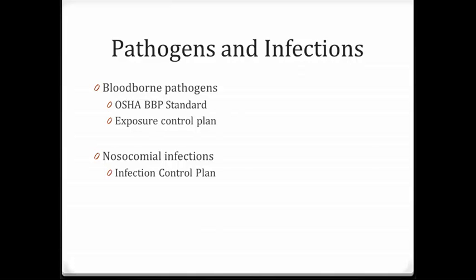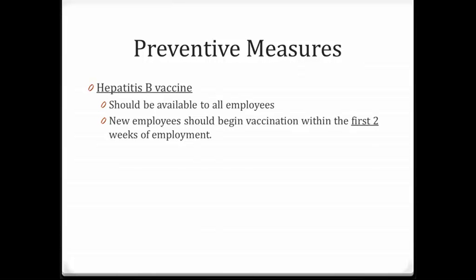Nosocomial infections are infections acquired by a patient after admission to a healthcare facility. The infection control plan indicates how to break the chain of infection. Hepatitis B vaccines should be available to all employees; new employees should be given vaccination within two weeks of employment. Hepatitis B is given in three doses: the initial dose, the second dose one month later, and the third dose six months from the initial dose.